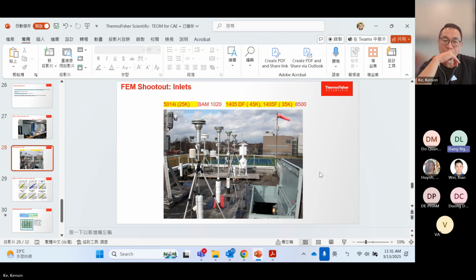It is more meaningful for the customer, because when the analyzer is easy to maintain and calibrate, and the price of spare parts is cheaper than the others, maybe it's easy to decide to choose the more expensive analyzer. Yeah, I think so. If I were the customer, I would definitely choose the one with the cheaper spare parts.